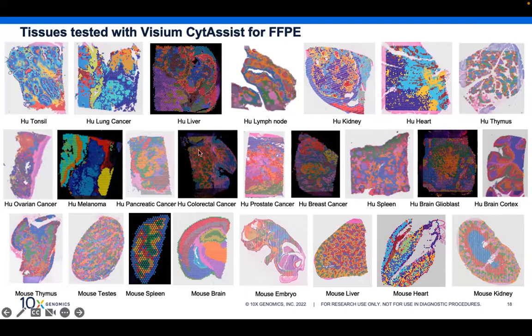The demarcations, as you can see in the tissue, are quite a bit stronger. We have more minute structures, which we can appreciate, minute anatomy in these tissue sections. More germinal centers are being identified in lymphoid tissues, cryptic structures in this tonsil, for example, and patterns which are consistent with the histology you'd expect, maybe for the mouse liver or, I think it was a mouse testes as well. There's this reticulated pattern that you see that almost looks like multicolored histology. It captures so tightly the transcripts that are coming across or dropping down from that permeabilized tissue.